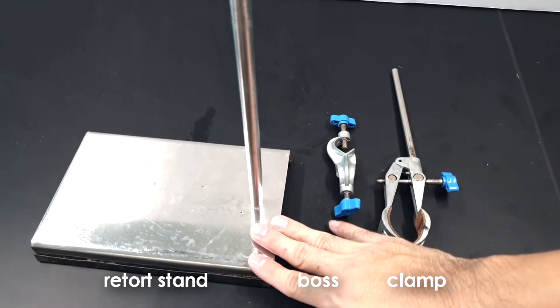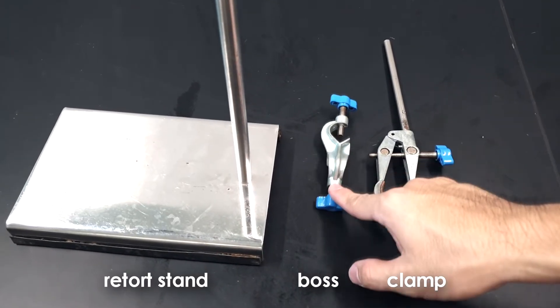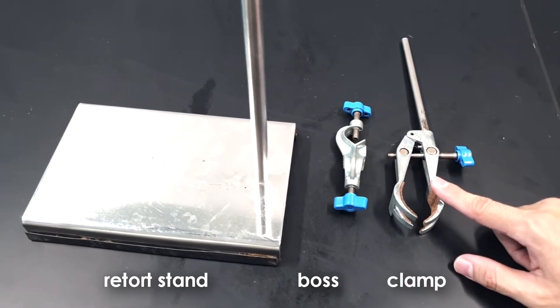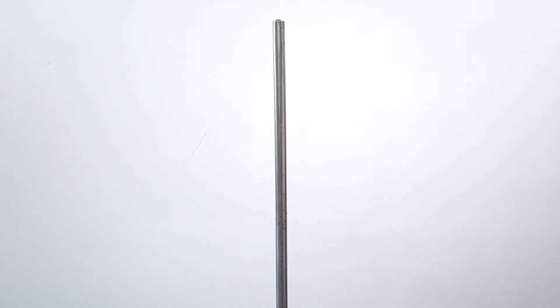There are three main components here, namely the retort stand, the boss, and the clamp. Place the retort stand on a table.